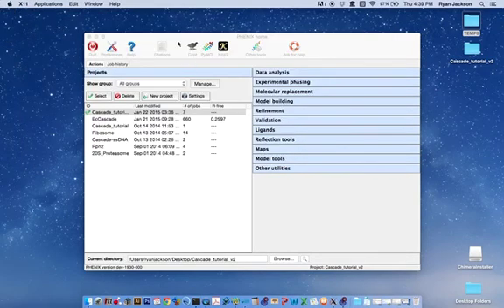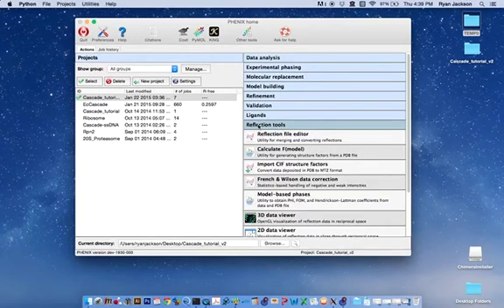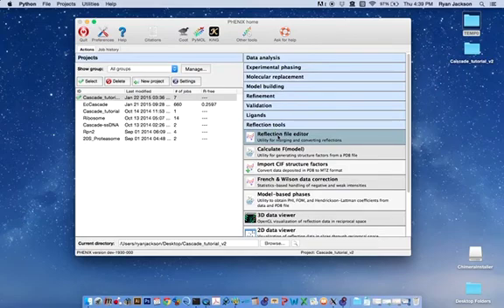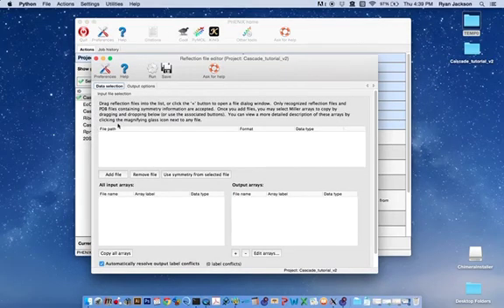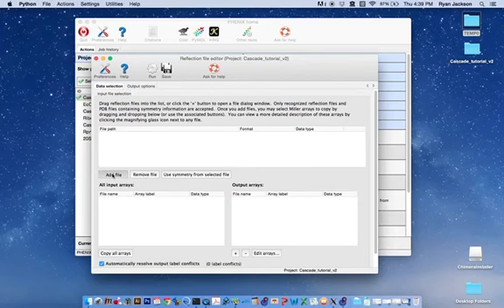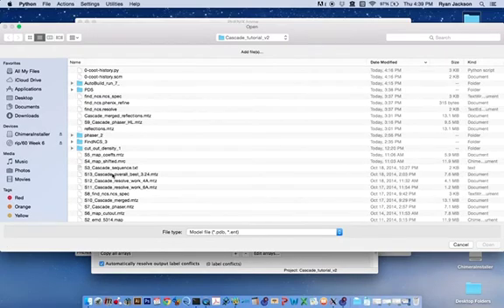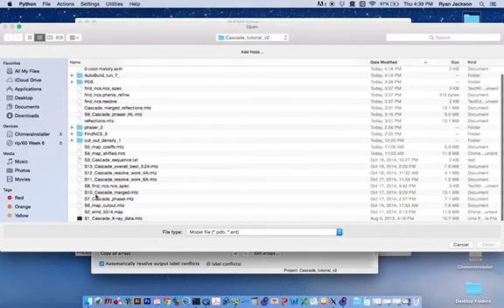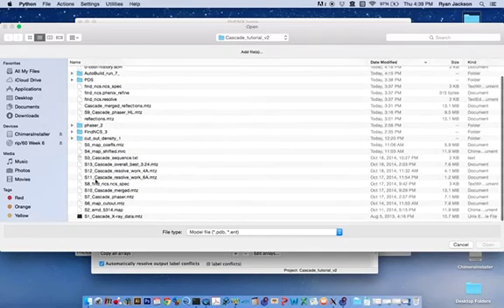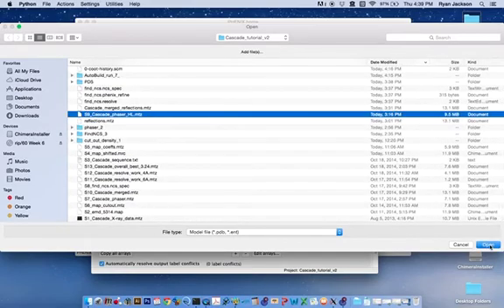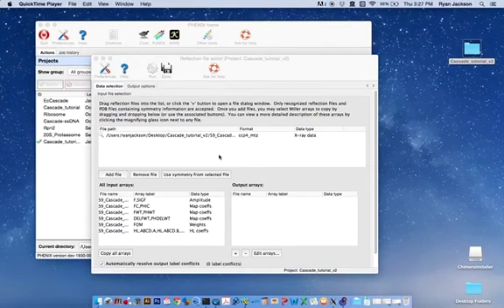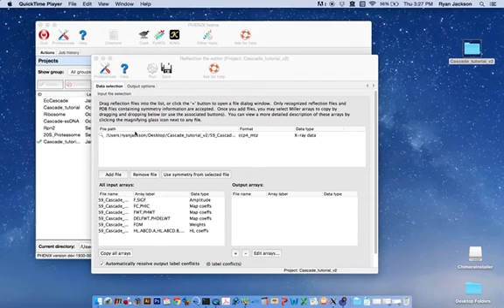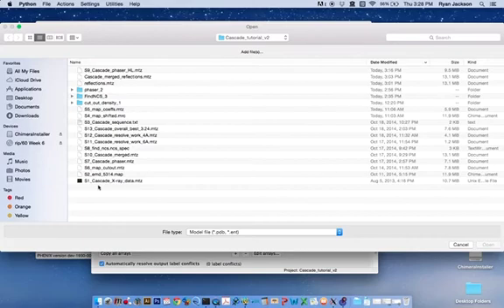To do that, we need to go into the Phoenix GUI, into Reflection Tools tab, Reflection File Editor. Here, we're going to add the file we just created that has the Hendrickson-Lattman coefficients, Supplemental File 9. We're also going to add the high-resolution x-ray data, which is provided as Supplemental File 1.